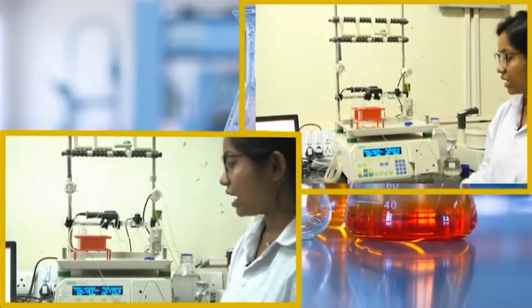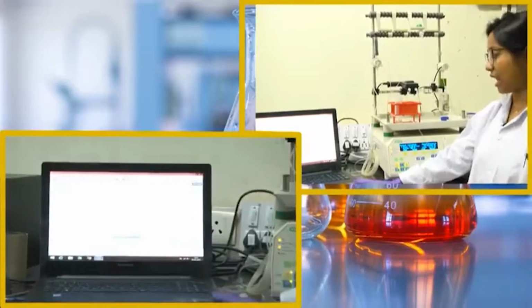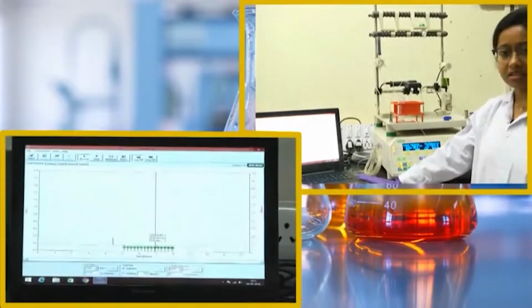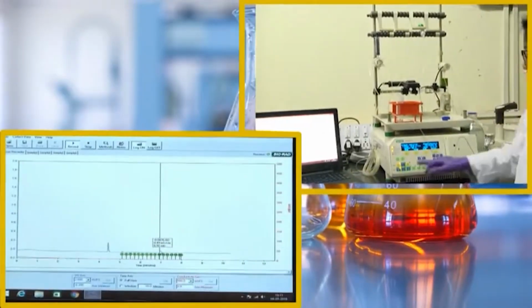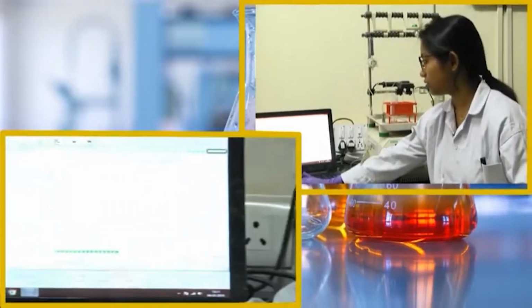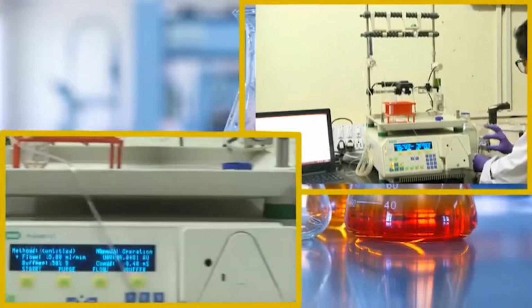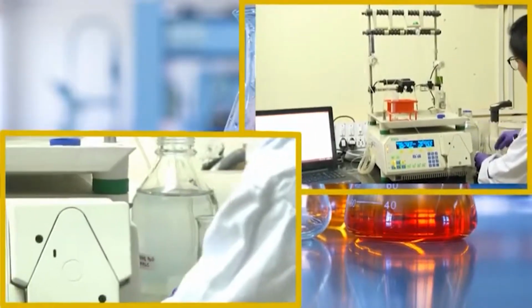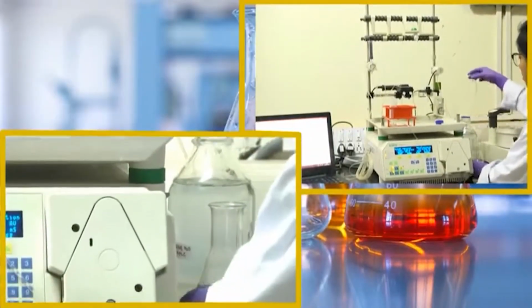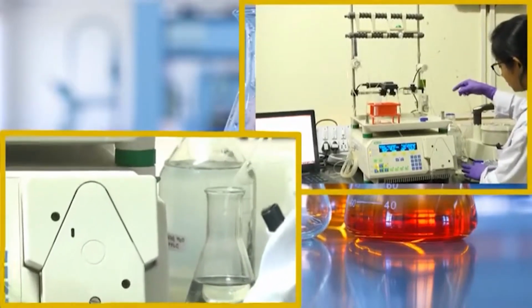So, almost 50 ml of water has been run, and in this monitor we can see that the blue and the red line is quite flat. So, that means everything has passed out and nothing is there. So, now we will stop this water and then we will run buffer A. Basically, this will ensure that my column is equilibrated in this particular buffer condition.